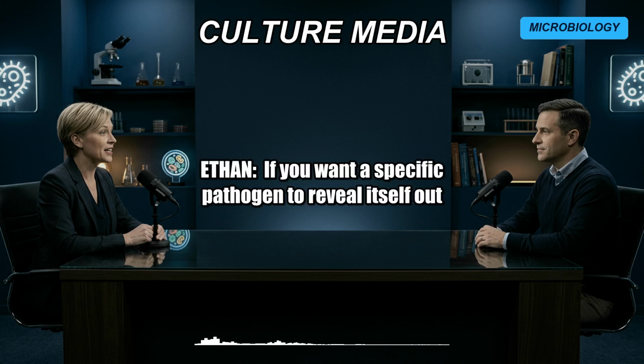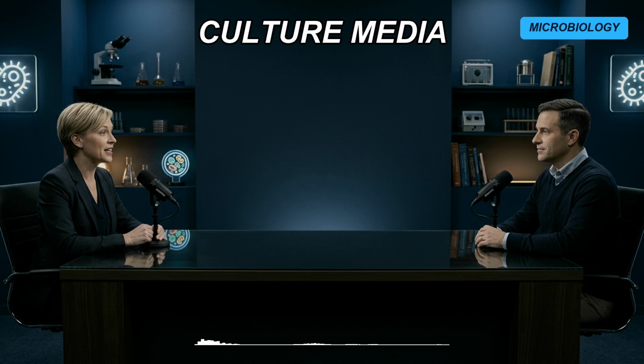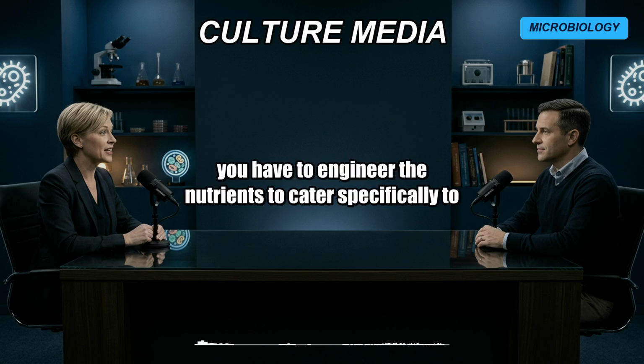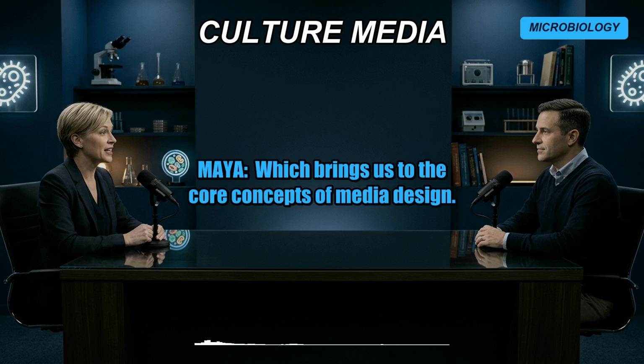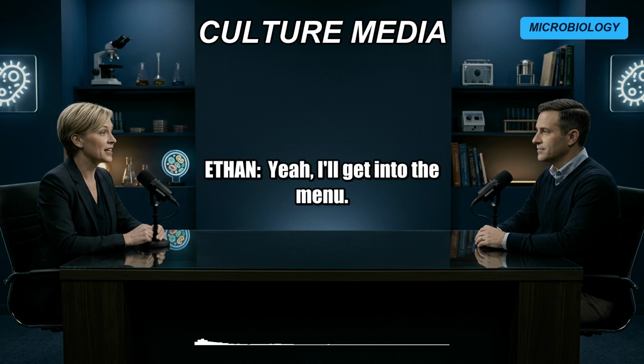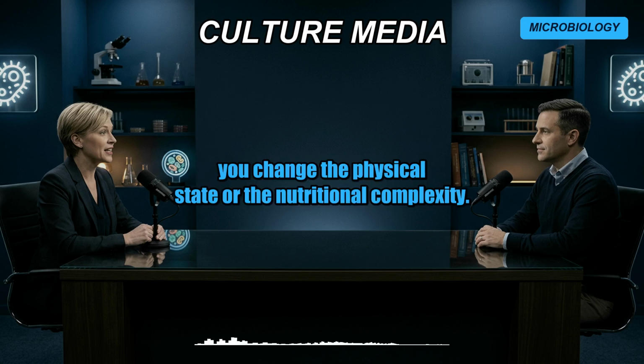Right. If you want a specific pathogen to reveal itself out of a mixed clinical sample, you have to engineer the nutrients to cater specifically to that organism's biology. Which brings us to the core concepts of media design. Yeah, I'll get into the menu. So depending on what you want to do, you change the physical state or the nutritional complexity.